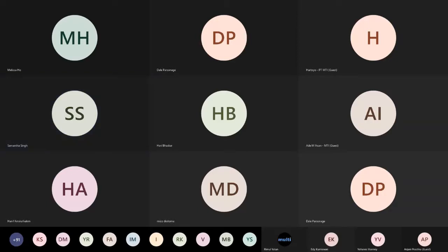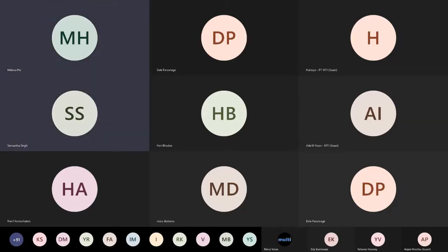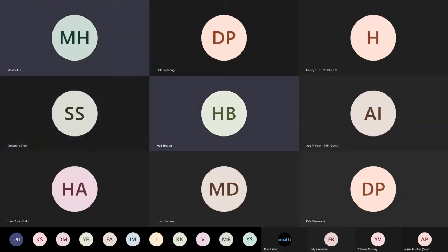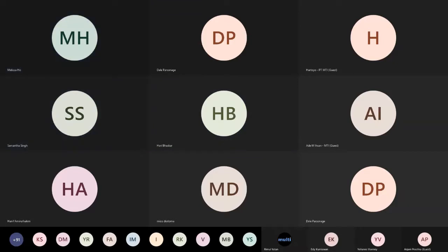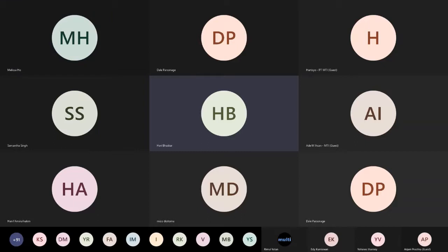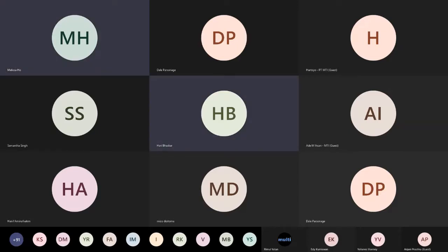The 1 kilowatt ZTM does not, to start off with, does not need Oh, hang on, Harry. You are muted right now. So can you unmute yourself? Yes, now you're fine. Okay. Yeah, so the 1 kilowatt ZTM, there is a bit of echo, I think. Yours there? Yes, I've just muted Dale.